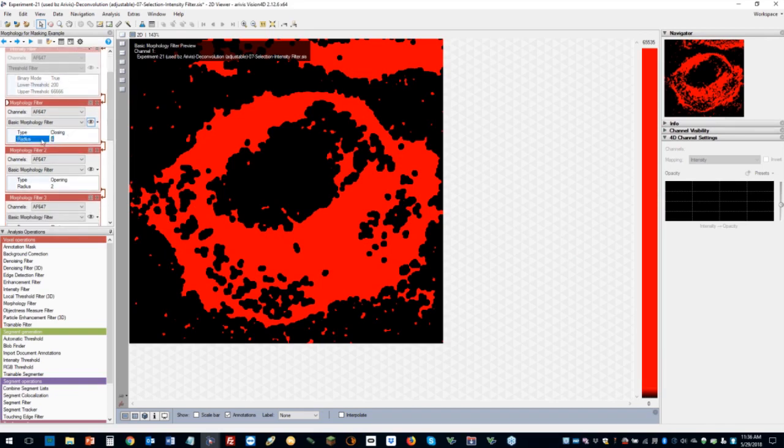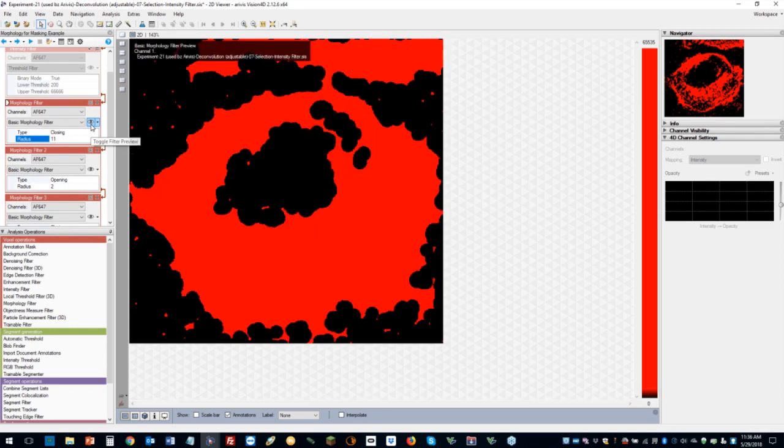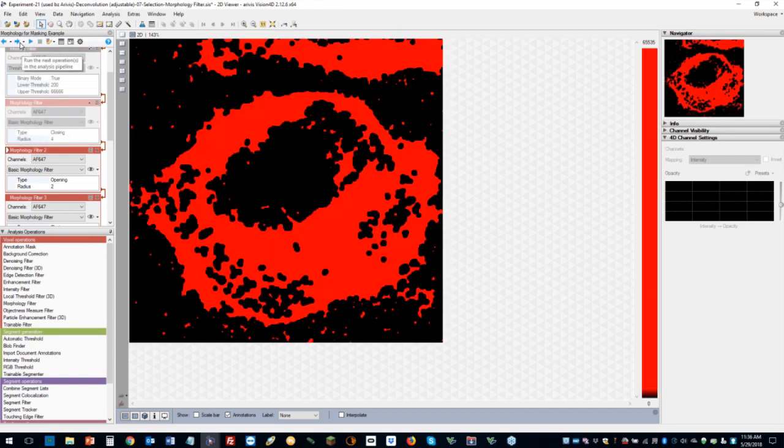And again, we can do the same thing. We can close very, very lightly. We could close very, very aggressively, like so. And the more aggressively we close, of course, the more computational time it takes. But this is how I would begin to build this idea of closing up the borders of the cell.